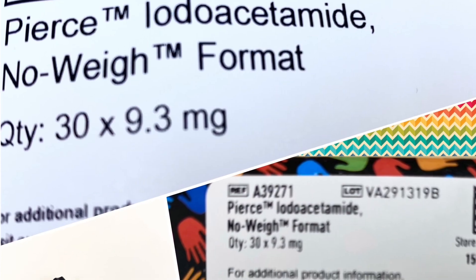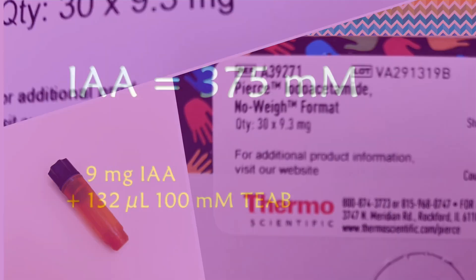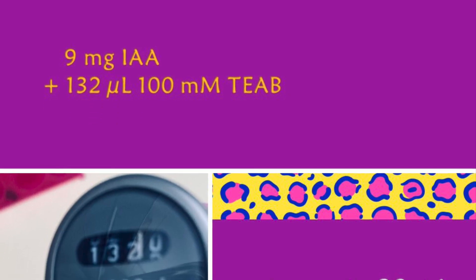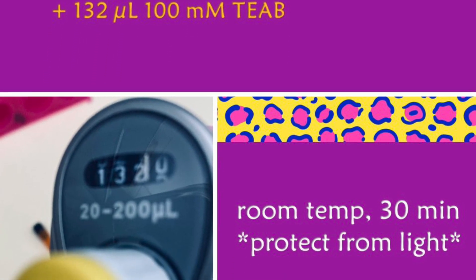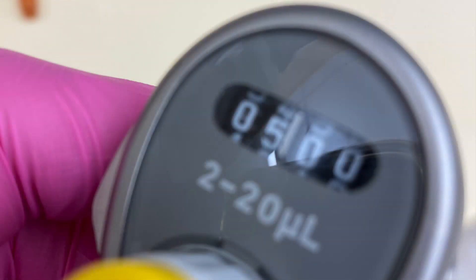Next step is the alkylation. I will be using IAA or iodoacetamide. I'm needing 375 millimolar solution, so I'm going to make that. After that, I will be taking 5 microliters of IAA solution, adding into my sample, and shake 30 minutes in the thermomixer at room temperature. I will make sure that my samples are protected from the light.